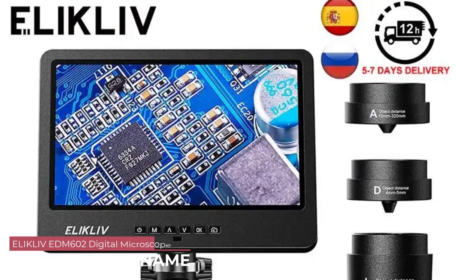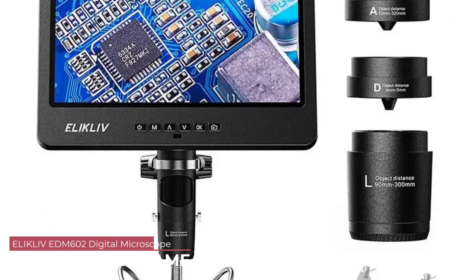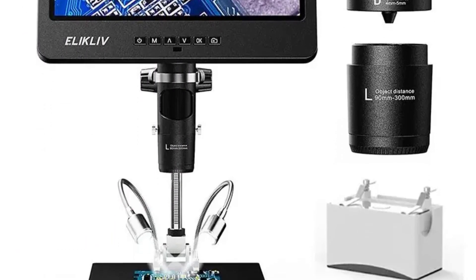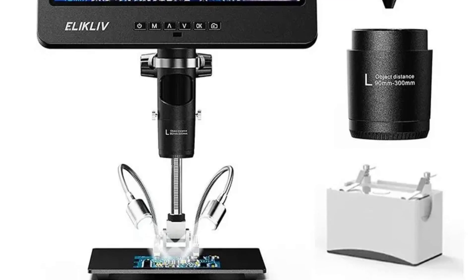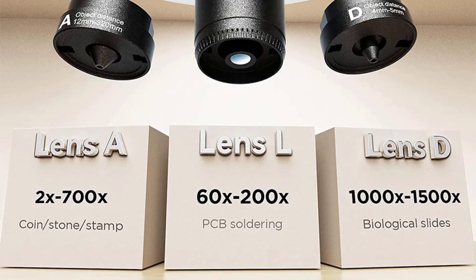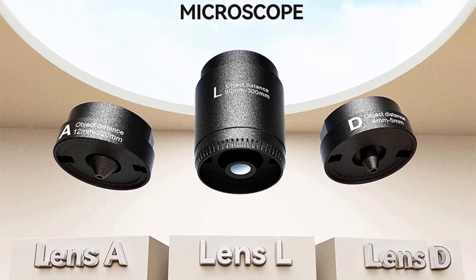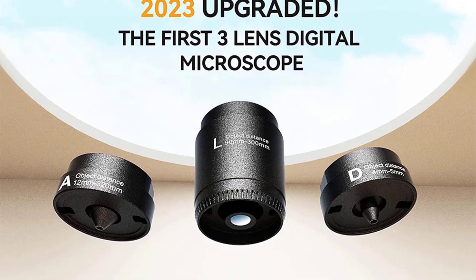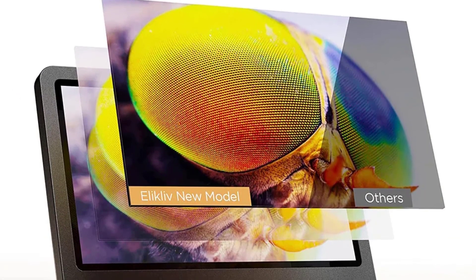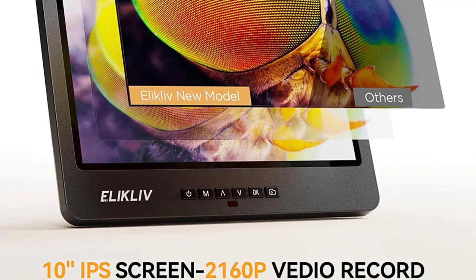Number 2: Elikliv EDM-602 Digital Microscope. The EDM-602 boasts a sleek and compact design made from durable plastic, making it lightweight and easy to handle. Its portability is a standout feature, allowing users to take the microscope wherever their curiosity leads them. The monocular drawtube design enhances ease of use, and the 178-degree real angle of view provides a comfortable viewing experience. The achromatic objective lens delivers clear and sharp images, ensuring precise observations across various applications.